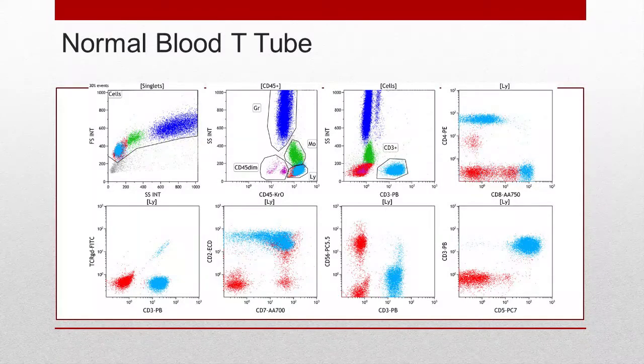This is just using the standard Beckman Coulter template, so it uses the Kaluza C software, which you can adapt and recolor populations, but it comes default with, I think, just 4 colors. But obviously there's a whole template within the system, so you can recolor populations should you wish. The templates are open so that they can be edited.